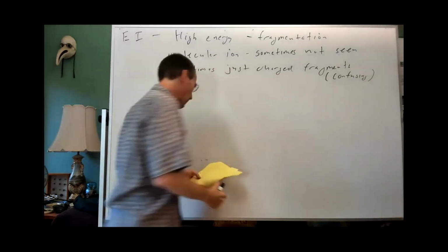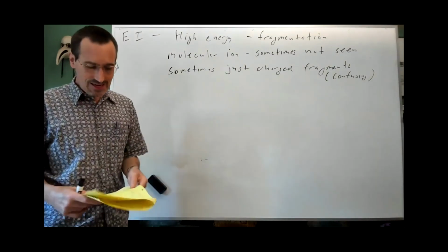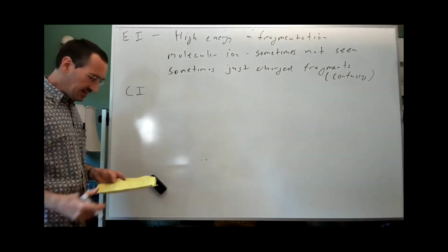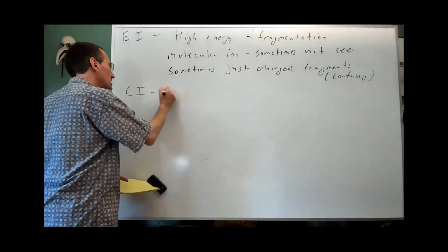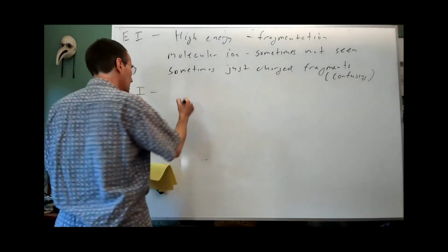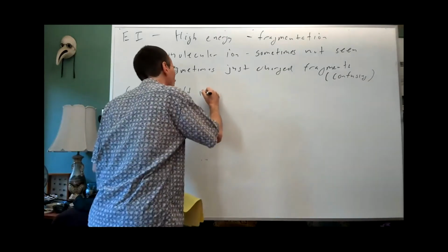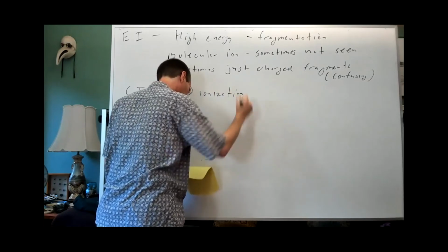Now, your textbook has a way of helping you out. It'll help you out, but it'll confuse you as well. So often when you don't see the molecular ion they'll also use CI, which, as I said, is also an older soft ionization technique. Soft ionization basically is anything that doesn't give it a good hard whack with an electron and knock out an electron.